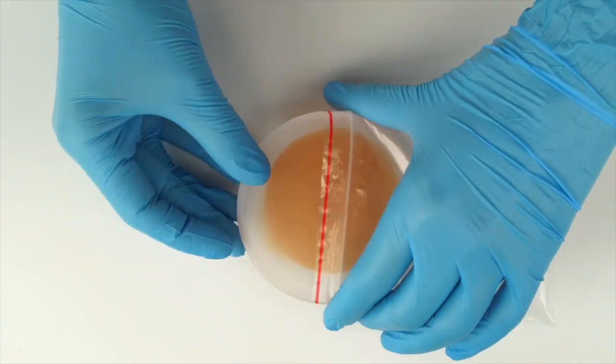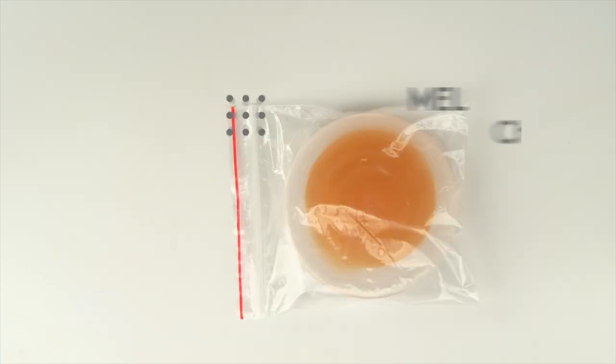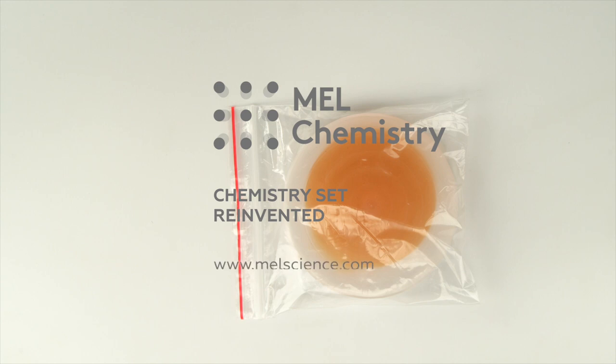Keep the plastic lid to repeat the experiment. Learn more about this experiment on our MELScience website.